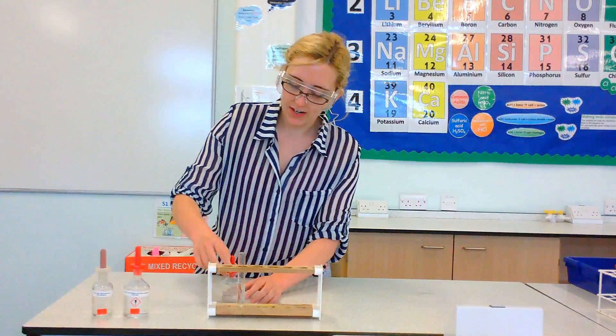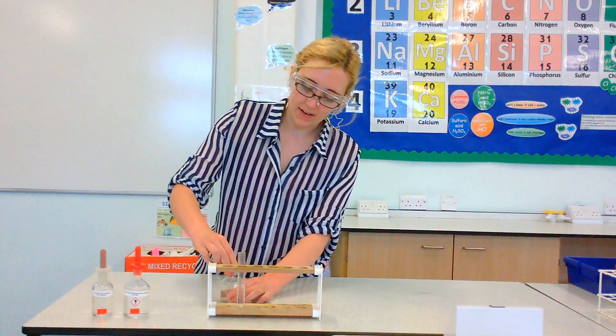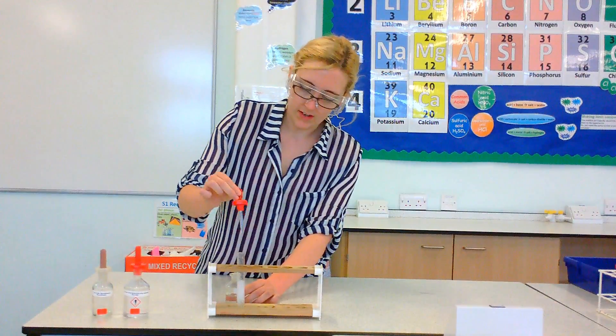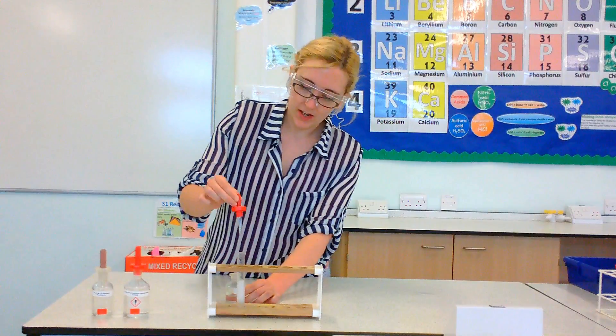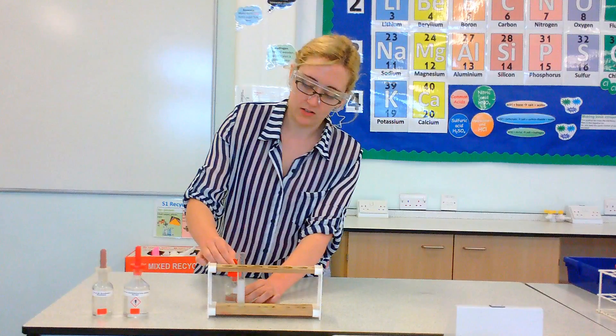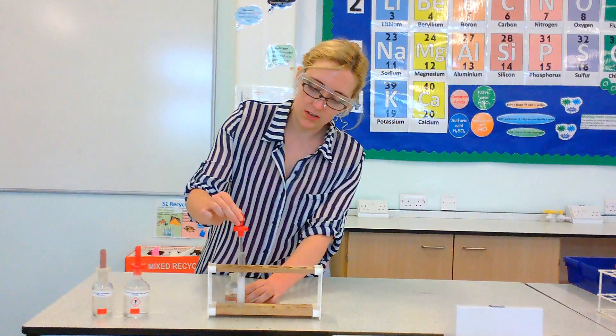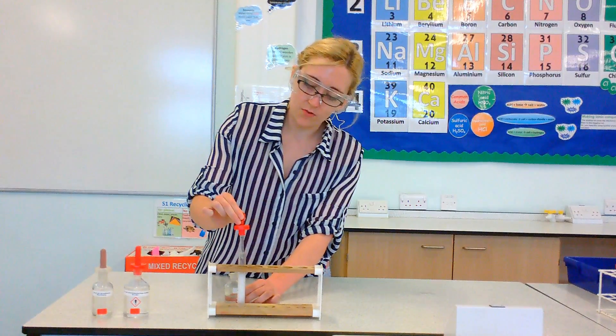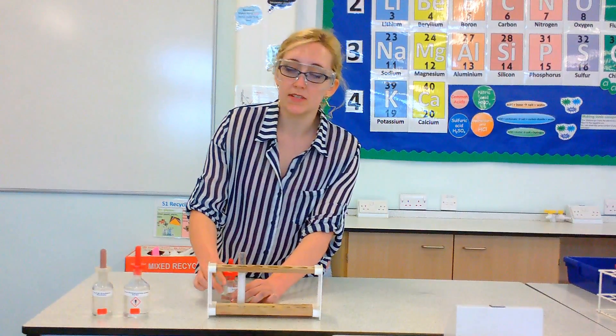So after I add my hydrochloric acid, I then add some barium chloride. This should produce barium sulfate. Because you've got sulfate ions in there, and you've also got barium ions, they actually form a solid precipitate.